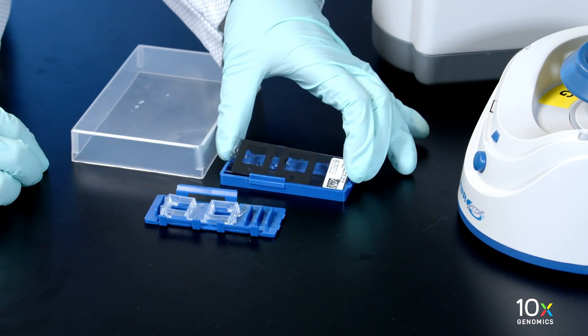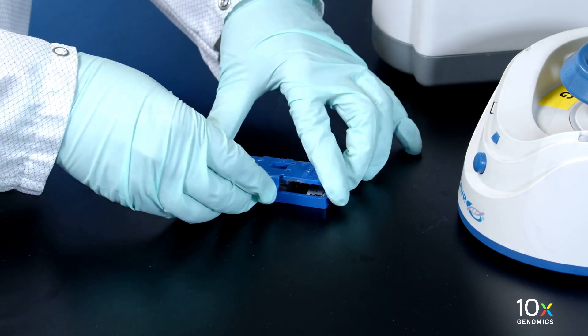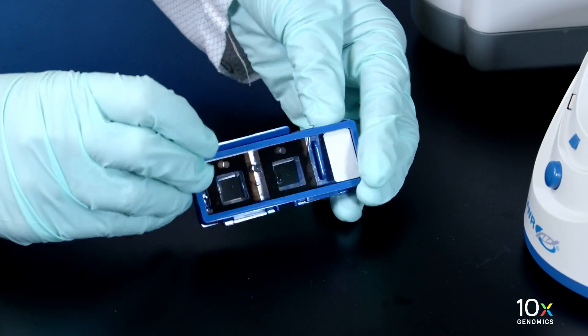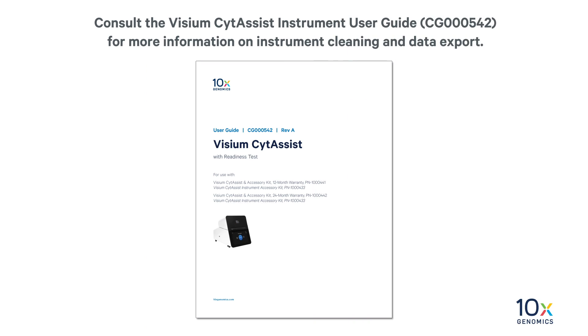Place the Visium CytAssist spatial gene expression slide in a new 6.5 or 11 mm Visium cassette. Some moisture remaining on the Visium CytAssist spatial gene expression slide is normal. Consult the Visium CytAssist instrument user guide for more information on instrument cleaning and data export.